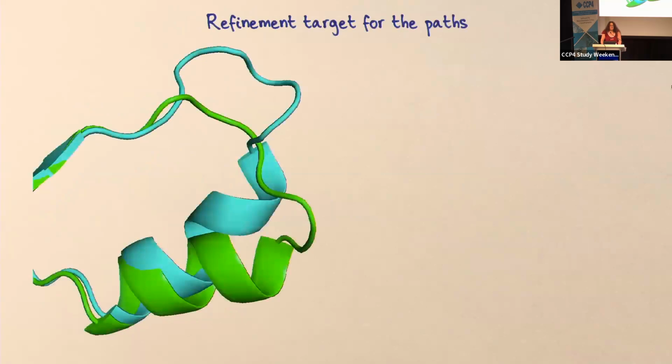How we do that exactly is that for every atom, we can calculate the pathway if you take a linear interpolation between A and B. That's just an atom moving in a straight line between the two. We also have a trajectory, as I've been showing you in the videos, which we calculate using the interpolation using the torsion angles.